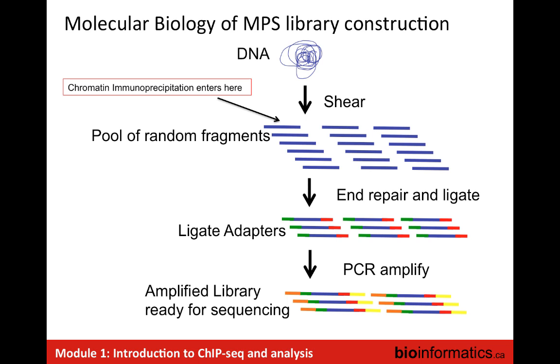Everybody understands that when you're working with a sequencing facility, typically your FASTQ file will already be split on the index. You'll get one FASTQ file, or two FASTQ files if it's a paired end read. That's already been split by index. So this happens behind the scenes. You don't see it. But keep in mind what's coming off the sequencer is actually three files: your read one, read two, which is actually your index file, and read three, which is your read two. And I'll talk about how those associations are made just so you can understand.